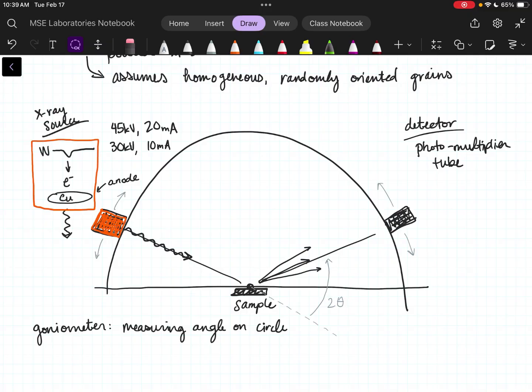So what we do is the instrument is going to continue the source line, the angle, whatever that angle is that the source is coming from. If that line were to continue through the sample, we then take from there up to the detector, and that is 2 theta. You also could say it as a sum of this angle and that angle. Yep.